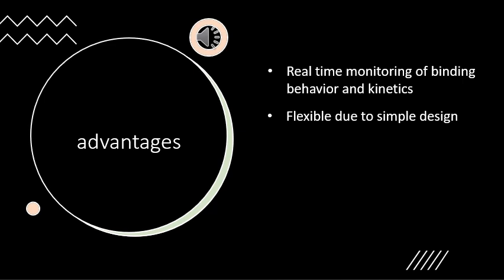Another big advantage, label-free detection. This is because it measures the effect of the molecule, not the molecule itself. You do not need to alter the original molecules in any way by adding fluorescent or radioactive components that bind or label the original molecules so that they can be detected. Instead, you have a guarantee that the original molecules are depicting the properties of the original molecules, not some altered compound.